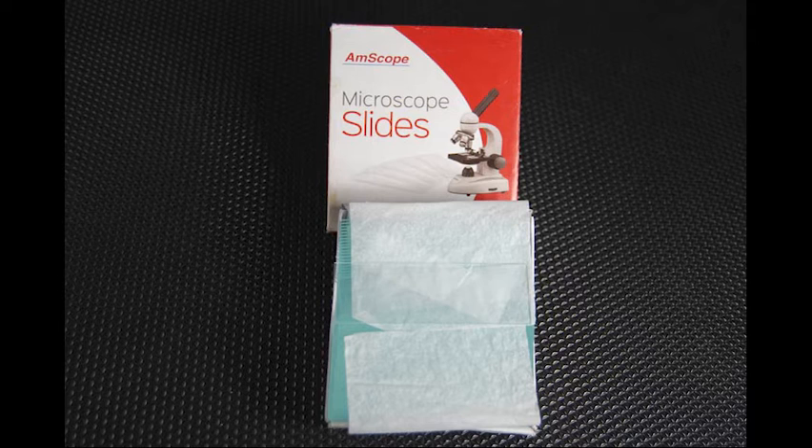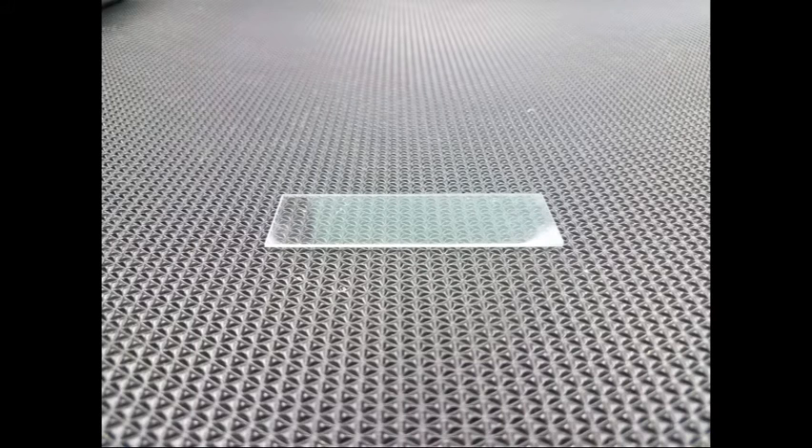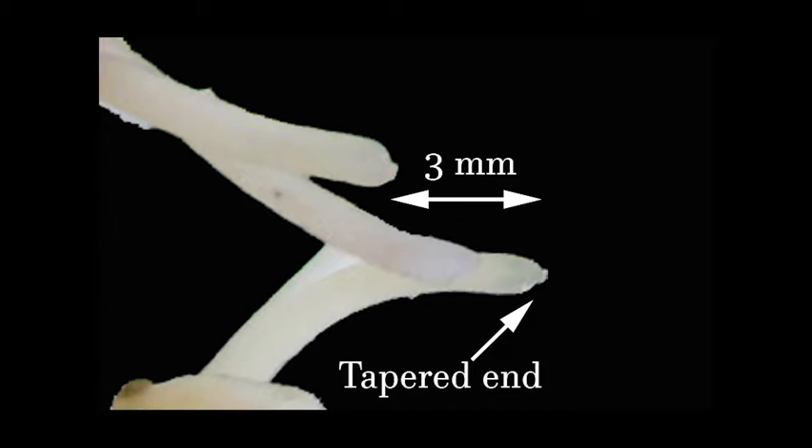Clean one microscope slide. Using a pair of forceps, remove a single complete root from an onion bulb or garlic. Place the slide on your desk and lay the root on top of it. Keep it moist. Using a magnifying glass, locate the most tapered end of the onion root tip. This is the area where mitosis is taking place.